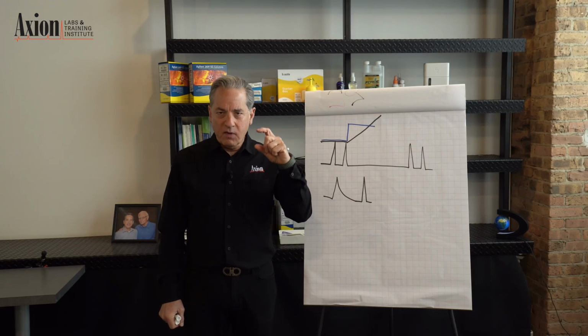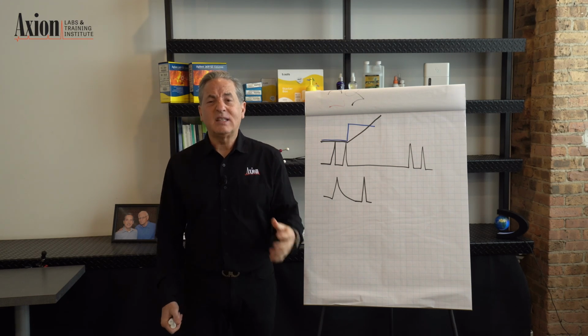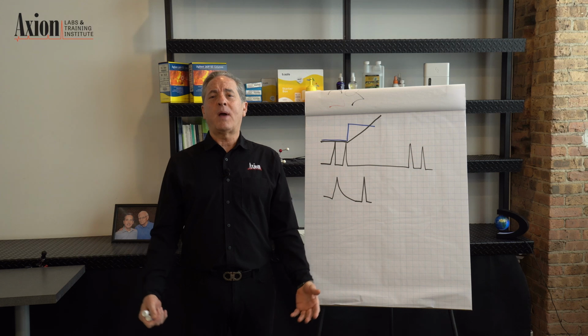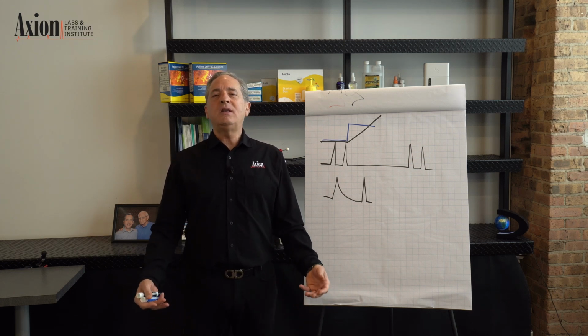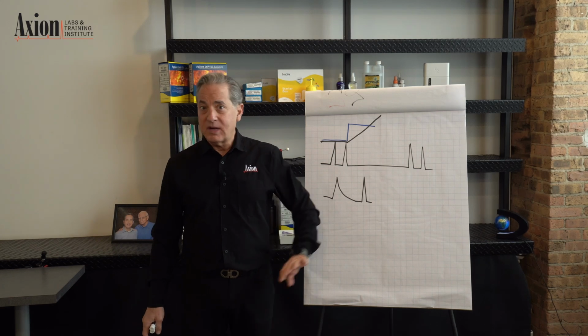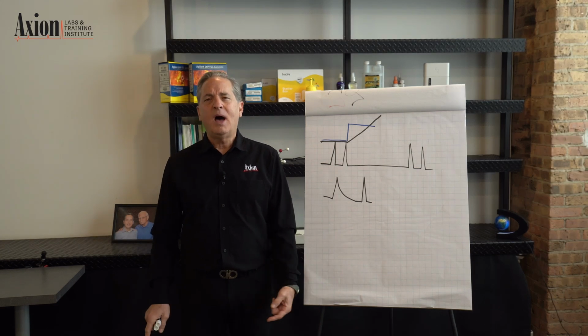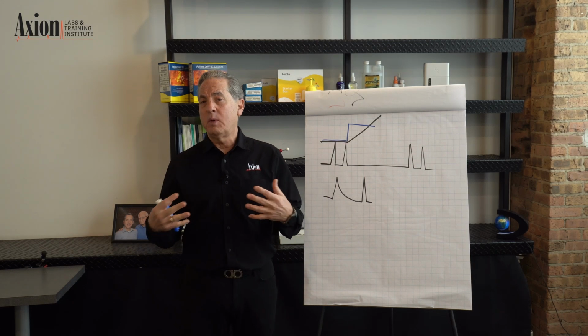Now, let's take one vial, put it in the autosampler, and tell it to inject that vial 6 times. And look at those chromatograms. You should get the exact same areas every single time. If you get different areas, different heights, then you have an autosampler problem. It's not a detector, it's an autosampler problem. It's because the little thing called the rotor seal, it wears out and you get poor reproducibility.